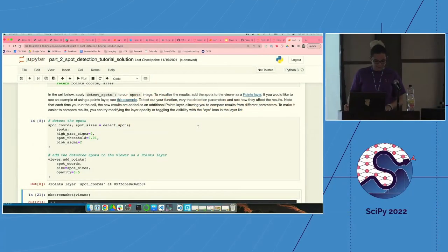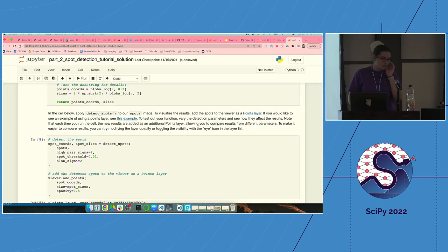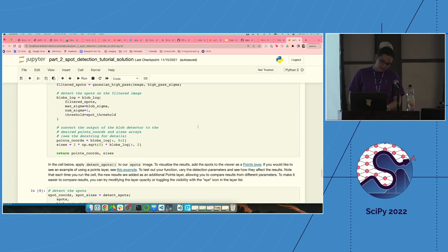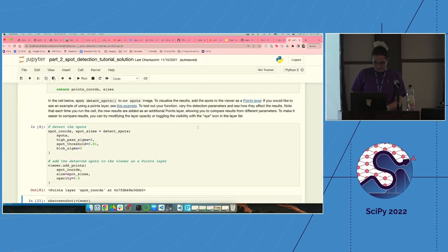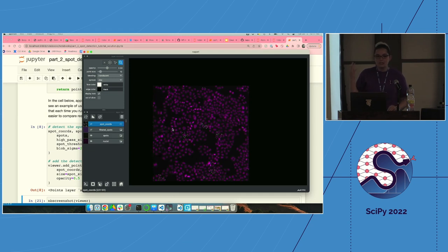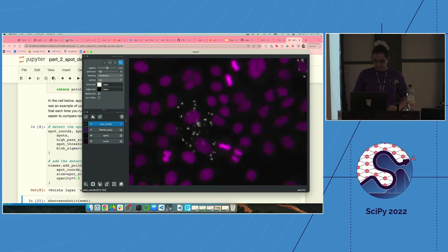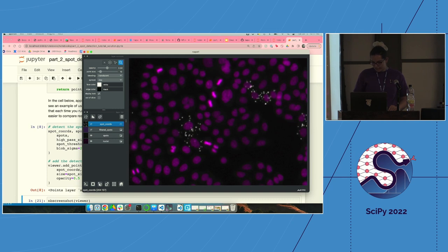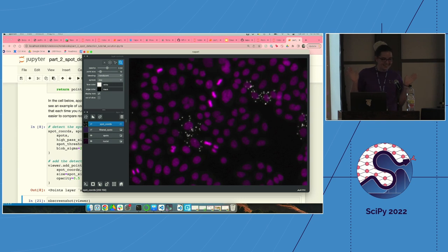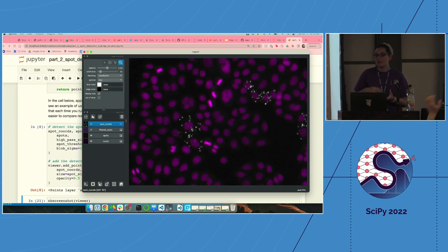We'll continue with the next part of the tutorial using the solution notebook. When we initially loaded in the image and spots, you have the nuclei in the background with spots hanging around them — these spots are RNA molecules. The goal is: we can physically see these spots, but how can we tell the computer to find them? The first step was implementing a Gaussian high-pass filter. Once you add that filtered image, compared to the original spots, it's actually less noisy.